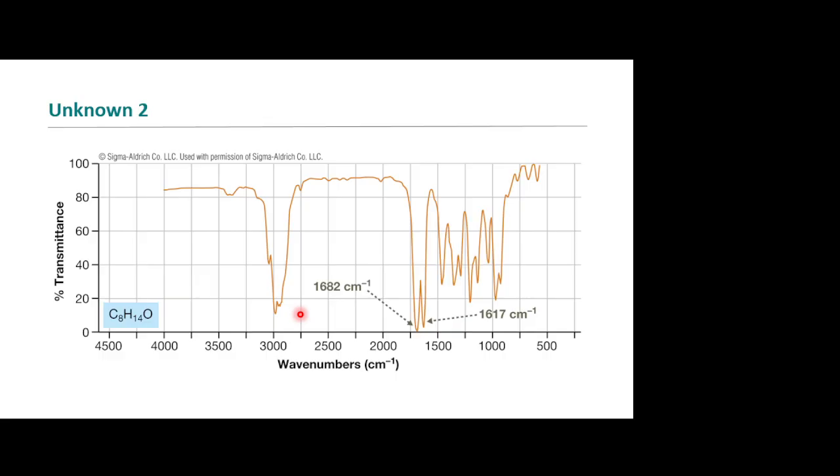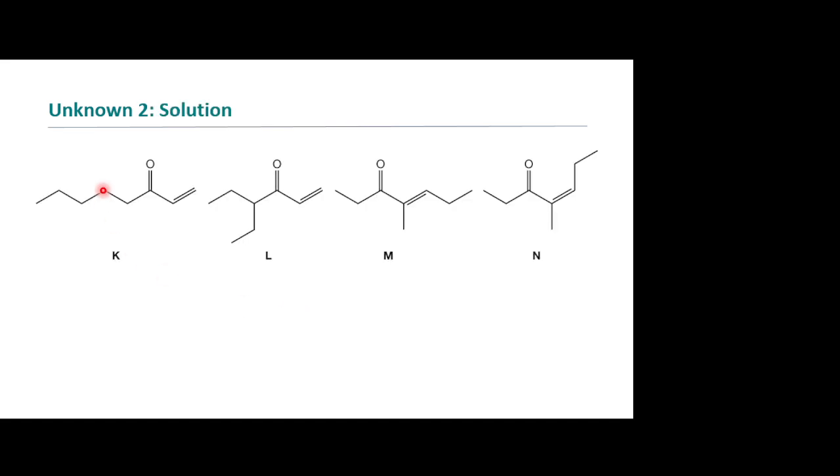So if it was a straight chain, like the one we drew out, that peak for the alkene would be more narrow, there wouldn't be as many. So this gives us only the CH3 here, we have the CH2s, and then this one might be a little different. And then this right here would give us our hydrogens off of that double bond.